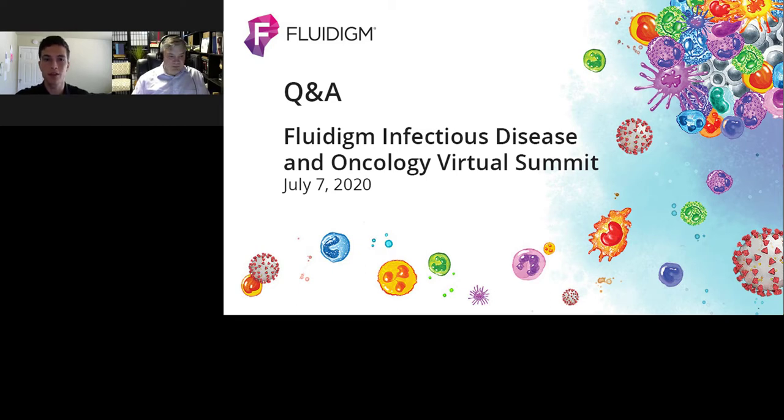And can I add more users or licenses to my free 1-year license? Yeah, so the licenses that are going to be coming with the Fluidigm instruments are what we call internet dongle licenses. Essentially what that allows folks to do is install the software on as many computers as they want, and one person at a time can use that license. It means that you can set up 10 users, 20 users, 100 on that license, but one person at a time can use it. So you do have a lot of flexibility, even with the license that comes with the software, to put it on as many computers as you want.